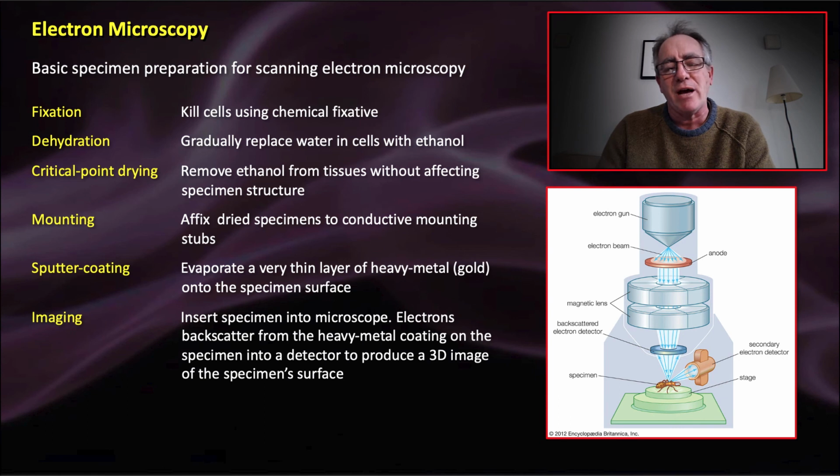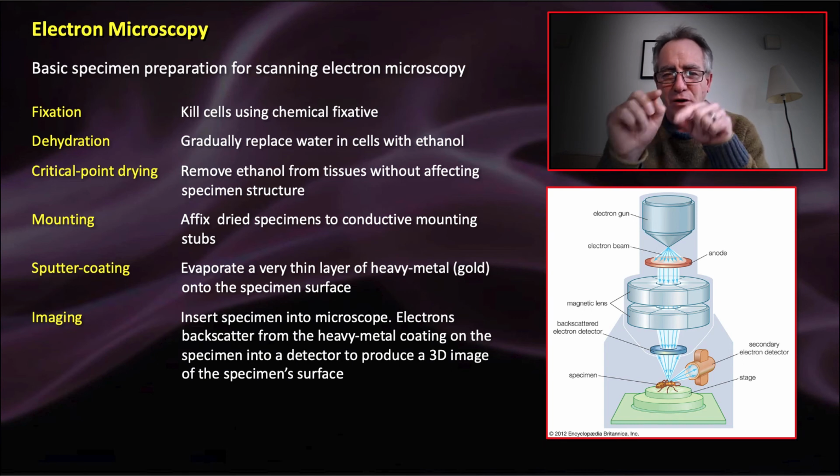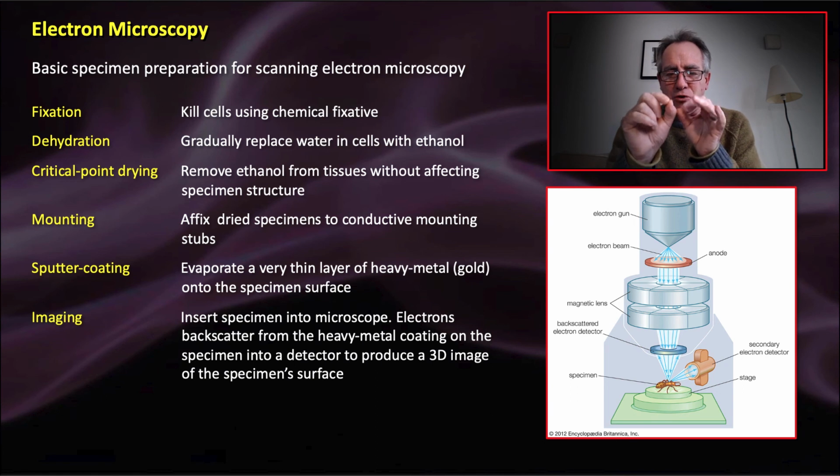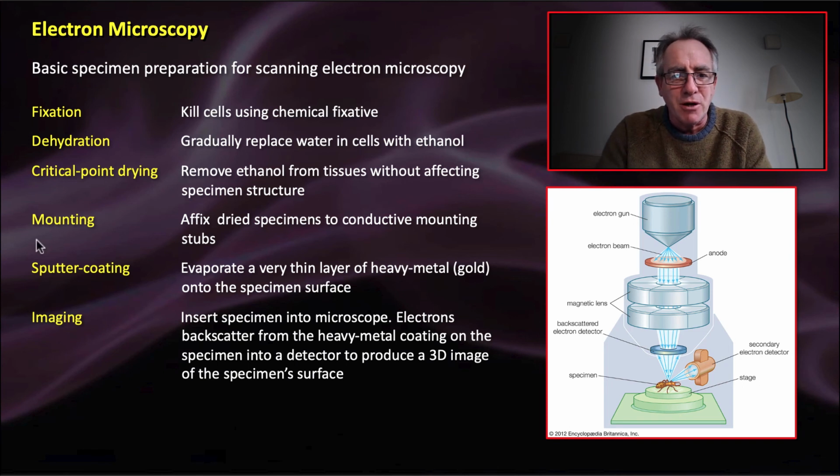Whoever made that beautiful image of the mosquito on the salt crystals spent a whole lot of time. They used their very, very fine forceps, and they got the mosquito standing up on the salt crystals. They probably did all of that while looking through a dissecting microscope. You get it on there, get it glued in place, and it's almost ready to be looked at with the microscope.